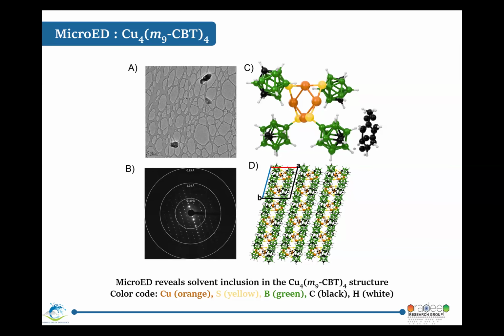The diffraction pattern represents the HKL planes, so it depends on the unit cell parameters we get. The diffraction pattern is from different planes. If you get the same plane of that other structure, you can see this kind of diffraction. This is one of the frames. We have a set of data, like from -50 to +50, so we will have 100 diffraction patterns, and each will look different.